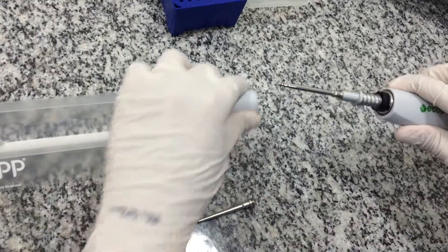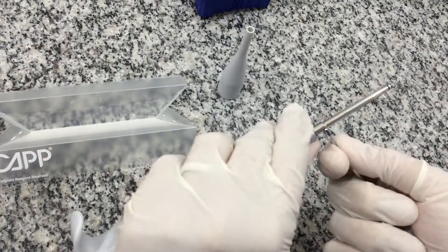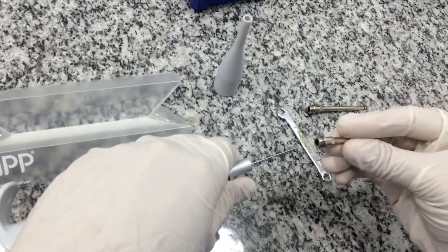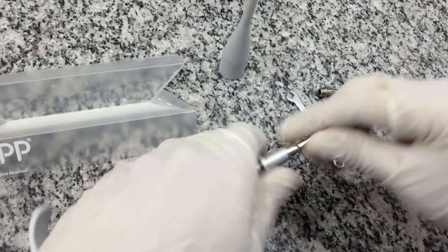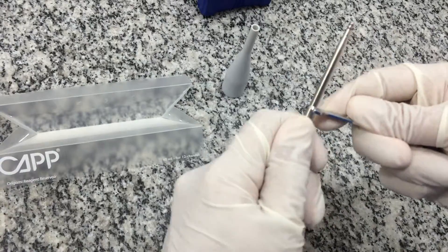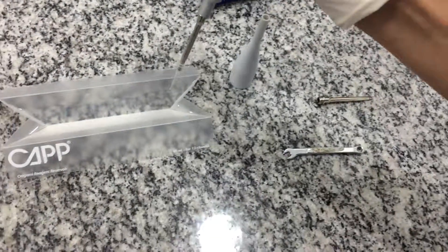Take off the tip ejector and unscrew the tip cone using a 6 mm wrench tool. Replace it, tighten it, and make sure that the leakage problem has been corrected.